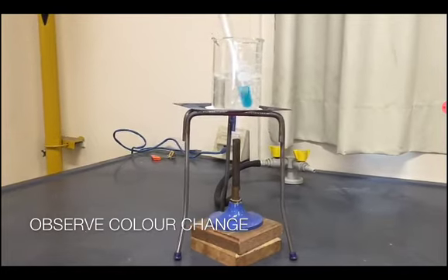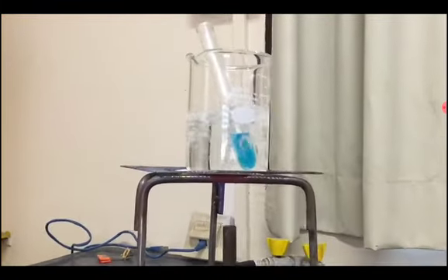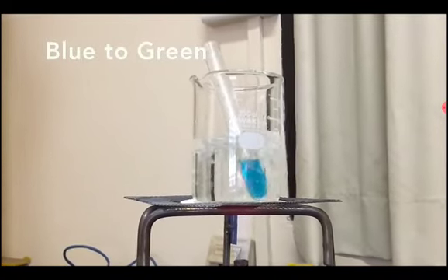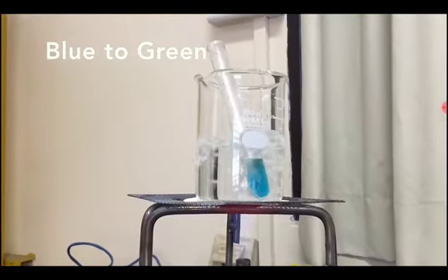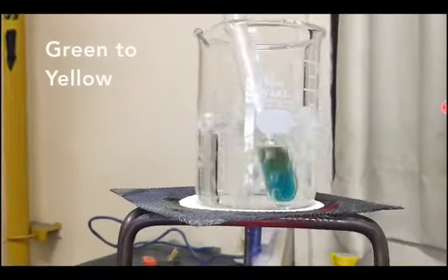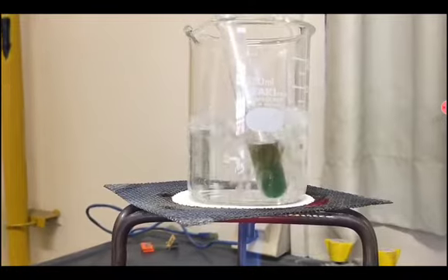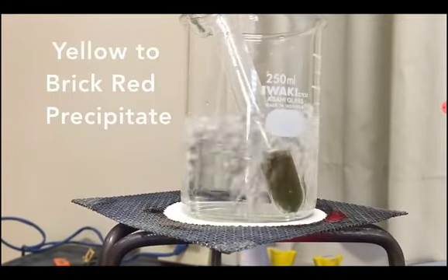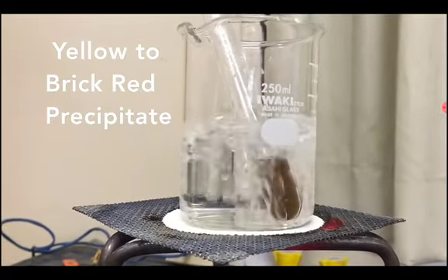Observe the color change. The original color now is blue. So in each case, we should be able to make deductions.